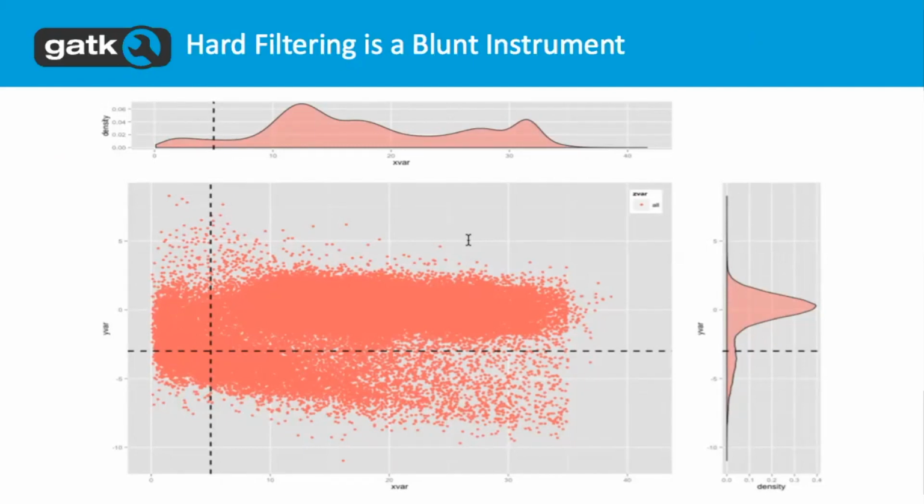However, in this case, we don't get rid of all of the false positives. Ideally, we'd like to keep this big, nice blob of variants here in this annotation space, but we can't really choose the thresholds to perfectly align with the edges of this blob.